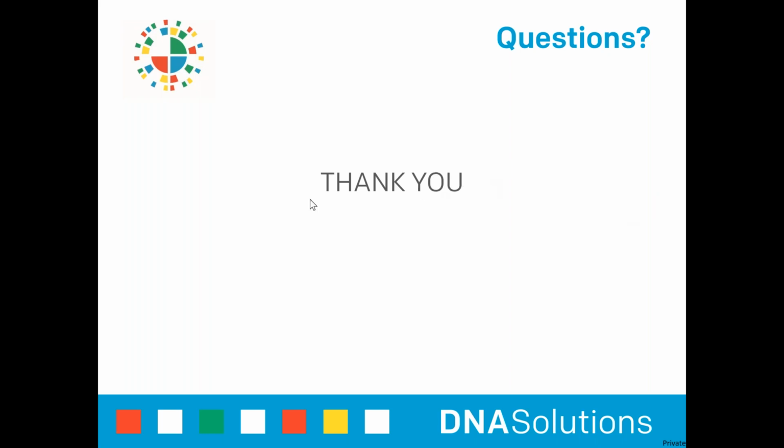I do have a few questions submitted. First question is, what is the most common non-standard samples you can test that are successful in providing profiles? Well, most non-standard samples are just that, non-standard. It's dependent on how much DNA has been deposited on the sample. Often toothbrushes are a really good option. They're something that most people use every day and should have a fair amount of DNA deposited. And we see more than 50% of the time we can get a very good partial or a full profile off of them.